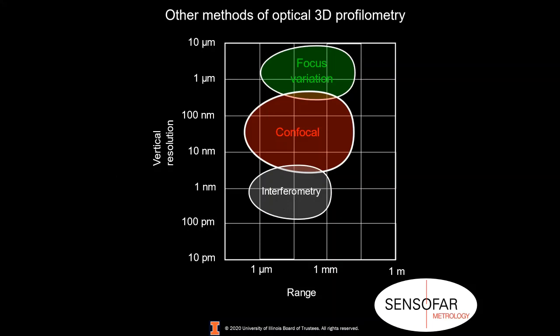Thank you. Another question we have is, obviously in focus variation and confocal, how does the microscope determine what is in focus? Obviously when we use our eyes, we adjust, but how does the microscope do it? Is it a computer algorithm? Yes, it is a computer algorithm, and it basically analyzes the frequency of the data in the picture. When the frequency of the variations there is much stronger, then you are in focus.